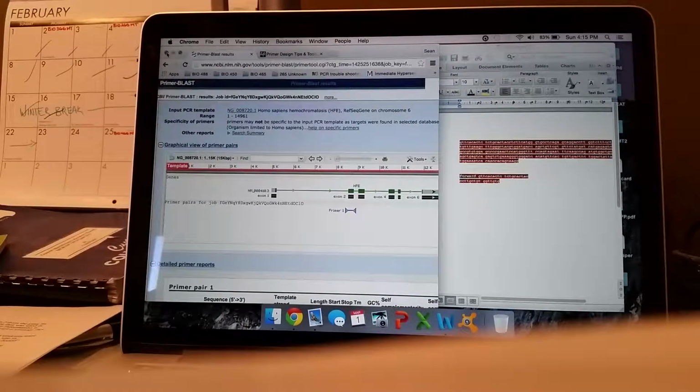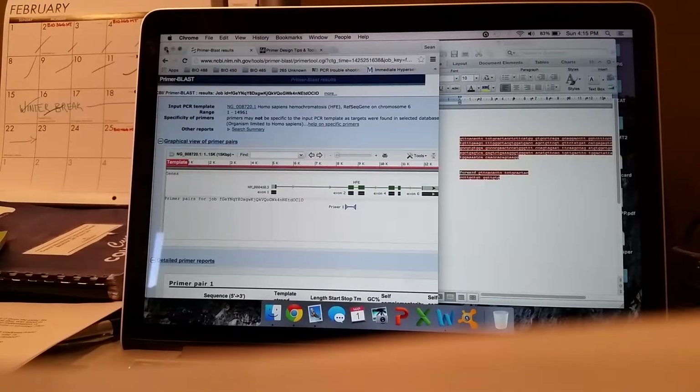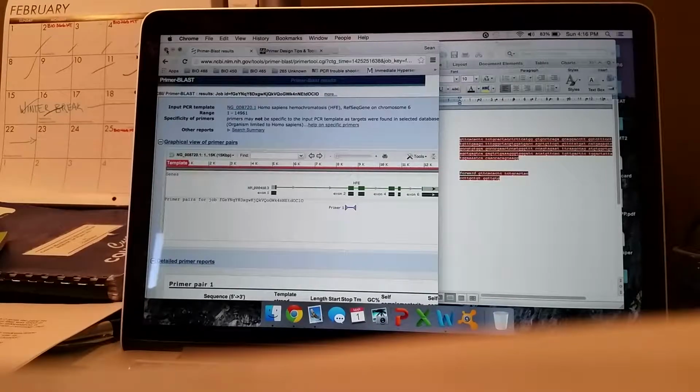It'll actually chew it back for you, so you wind up with blunt ends. Then you use CIP and SAP on your vector to stop it from re-annealing to itself, and then you add your blunt-ended little piece of human hemochromatosis, and it will then affix itself to the now CIPed or SAPed pUC19 clone.